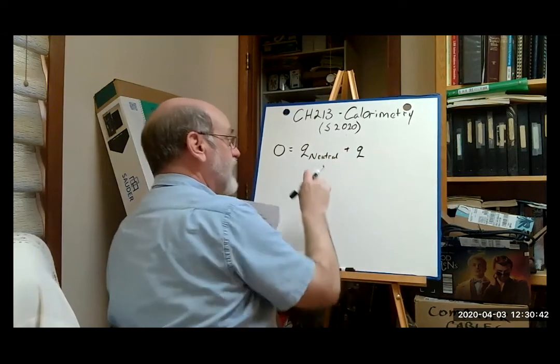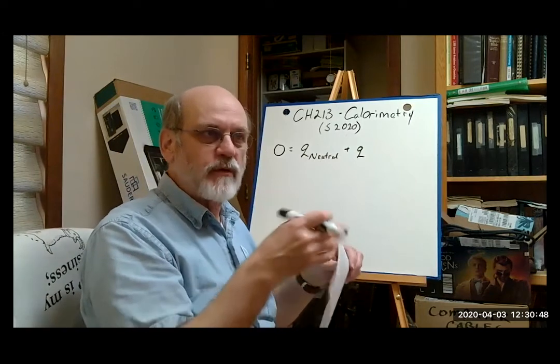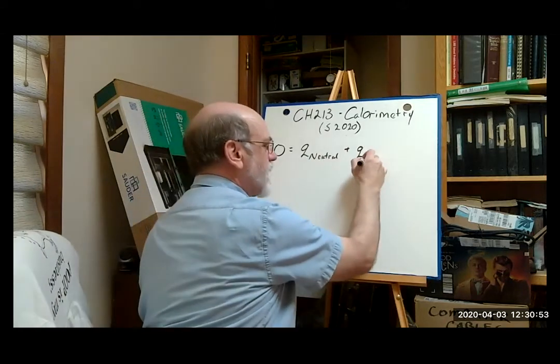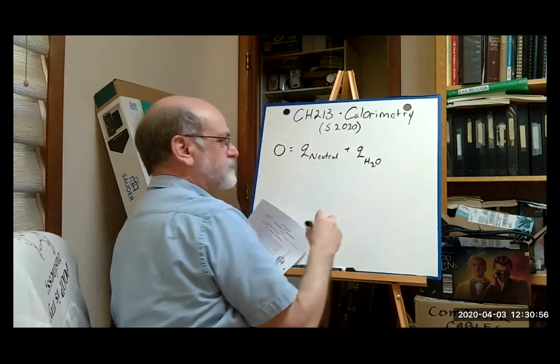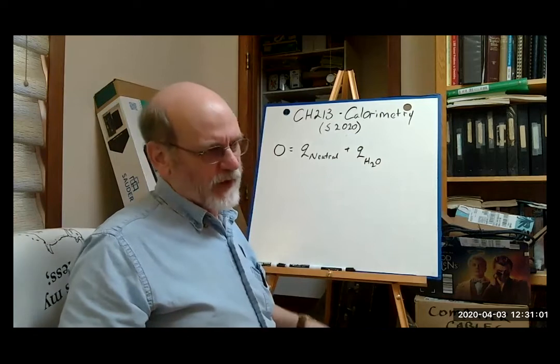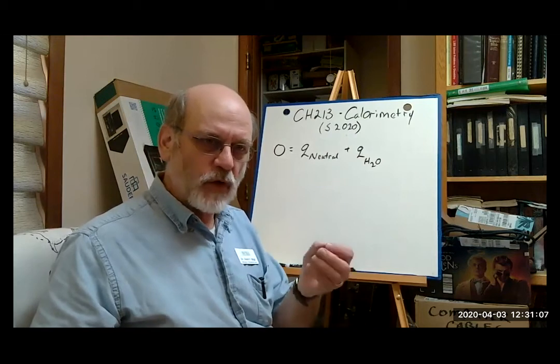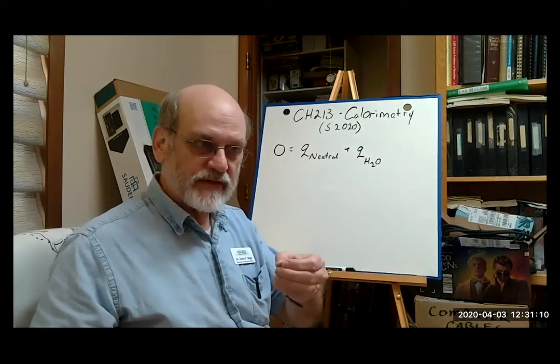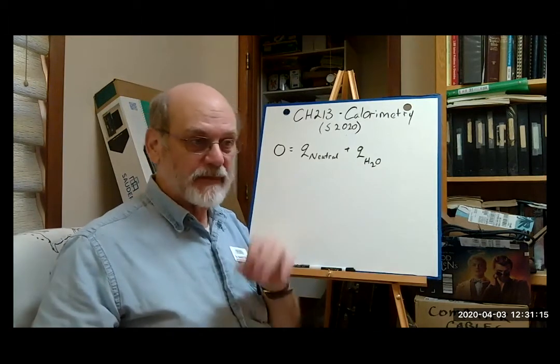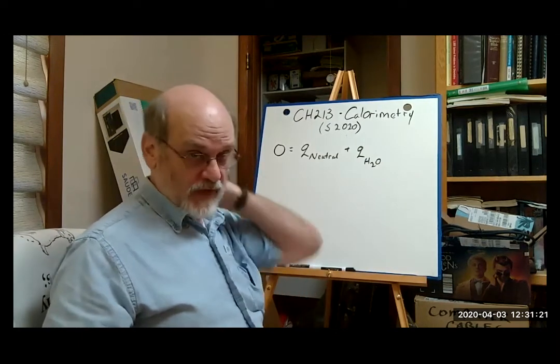Then there's going to be, that's for the reaction of the sodium hydroxide and the sulfuric acid, as if they were separate from the water. Okay, so they're reacting. Then you have a change for the water. Now, since these solutions are reasonably dilute, 1 molar and a half molar, we're going to assume that the total volume of the acid and the base are water. We know that's not strictly true, but it simplifies the calculation if you consider both of them as just water.